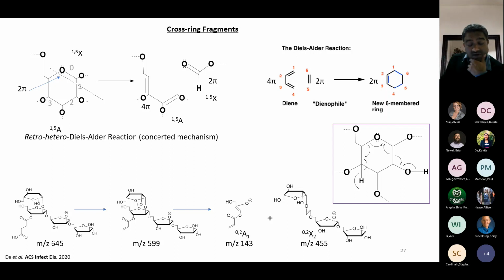There is an alternative mechanism. A traditional mass spec analyst will say that either the oxygen is carrying the charge, or this hydrogen is cleaving by a homolytic cleavage, where the two electrons go to either atom equally, and then it goes for this kind of fragmentation. But this kind of fragmentation cannot be explained that way, because if this hydrogen is replaced by a substitution, a carbon or any alkyl group, then this fragmentation pathway cannot follow. It has to be considered like a hetero Diels-Alder reaction.